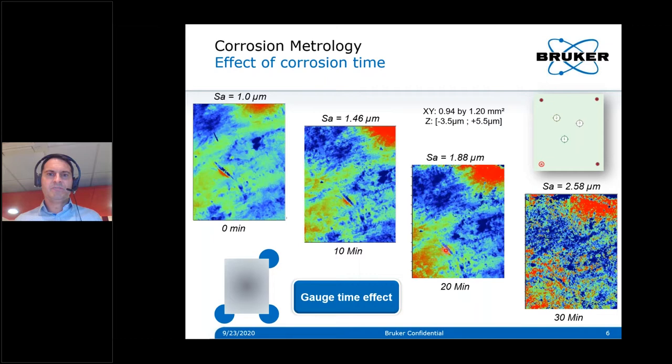However, as you can see, whenever we go to a higher corrosion rate, it's very challenging to find any other specific details except relying on the positioning you set up previously. In that case, we can see that this roughening happened at small scales and starts to expand until it really erases or smooths out some of the details that were present before.